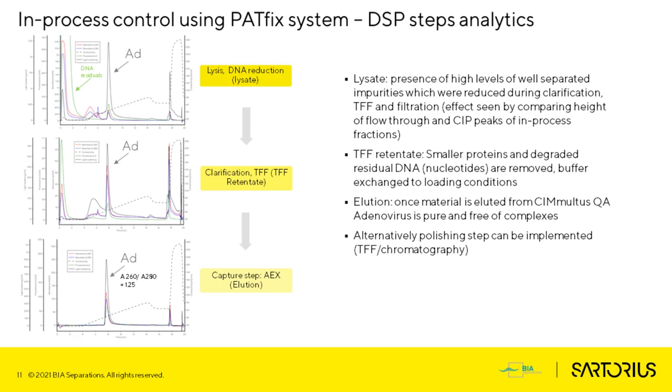Additionally, if an ultra pure product is needed, a polishing step can also be implemented, let's say another TFF or chromatography for concentration and buffer exchange.